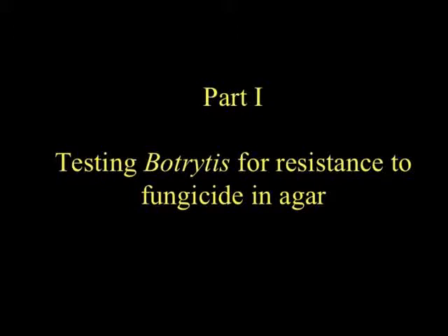Resistance means that the fungus can overcome the fungicide on a plant and cause a disease, even though the fungicide is present. However, there are some cases where a fungus can actually grow on a high concentration of fungicide and appear to be resistant to that fungicide in agar, but it cannot overcome the label rate of the chemical sprayed on a plant. And so then you really can't say that it's resistant.